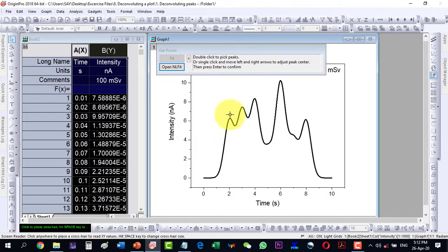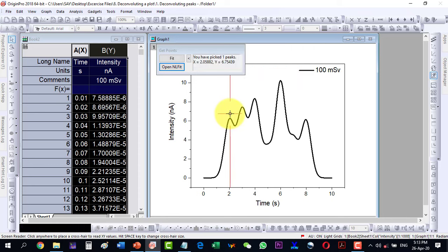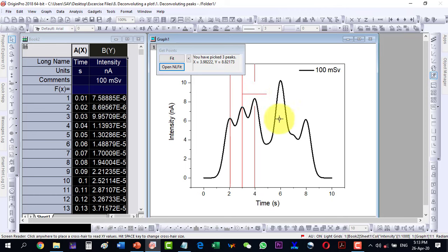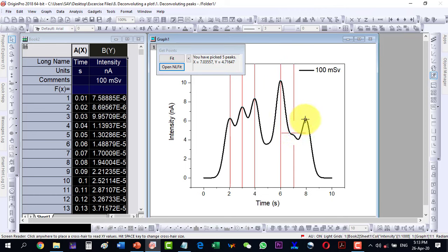The new menu will say 'double click to pick the peaks,' so I will have to double click in order to pick the peaks. It's not necessary that the cursor is exactly on the peak — I can move around like this and it will select the peak. I double click here, and when the cursor is on this peak I double click, and similarly here, and another peak here I double click as well.